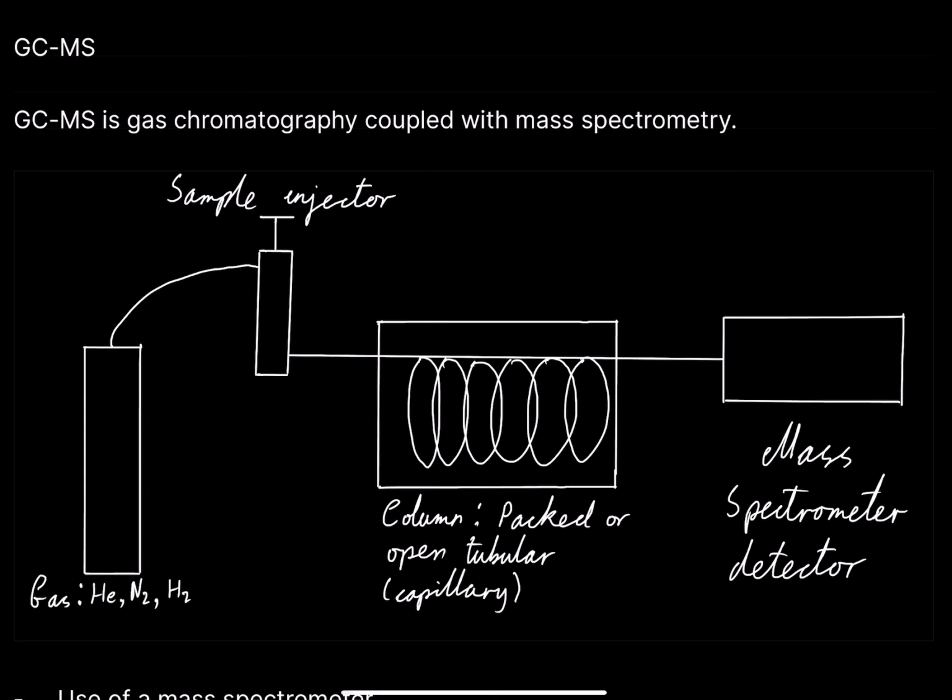So like I said in the introduction, you can identify compounds by just doing gas chromatography, but sometimes it can be a bit difficult because there's not a huge difference in the retention times. Sometimes there are, but it can be difficult to decipher. It may just be that you have different retention times, but it's not really clear what compound is what. We have separated out our compounds into separate, pure gases.